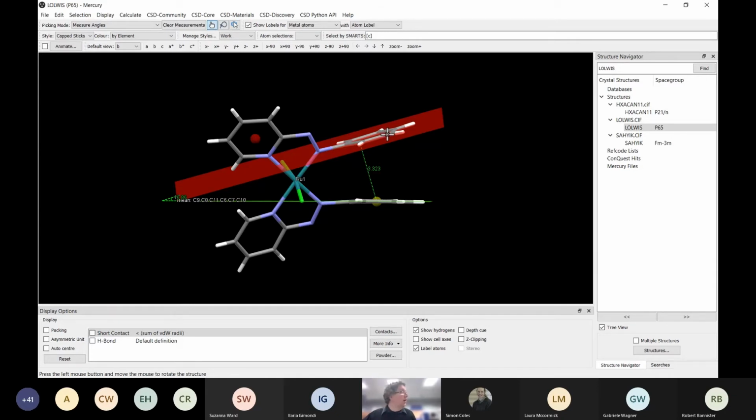And if you want, there's more on the websites as well. CCDC have produced a lot of videos, tutorials, and demos that you can go through and pick on things. But I think that is it for my demonstration this afternoon.